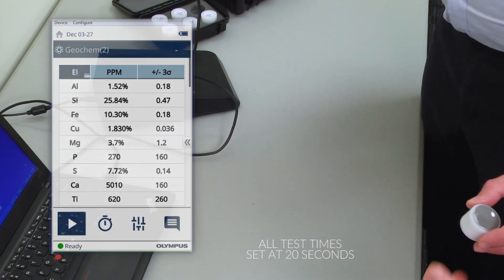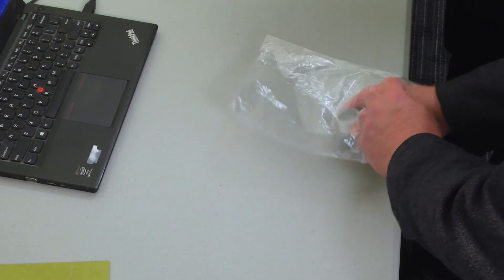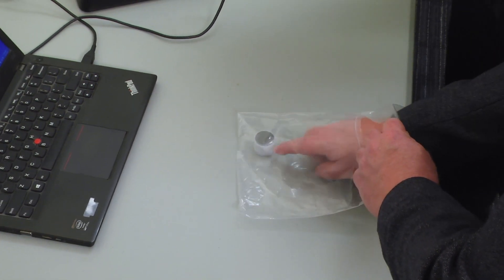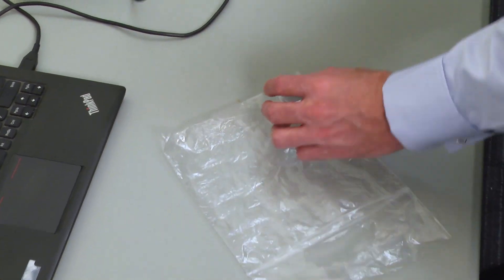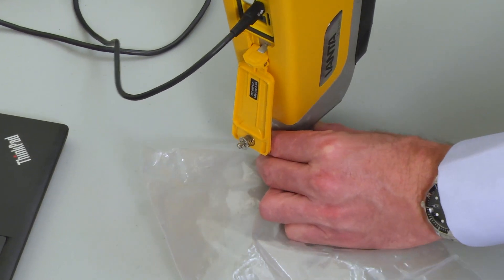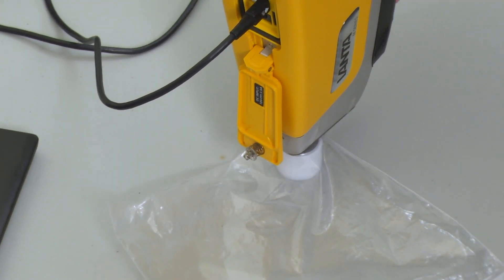Now let's put it into a plastic bag. Okay. Lots of our customers test samples in a plastic bag. So what's the impact of the plastic on the results? Let's have a look and test the same sample through one layer of plastic.